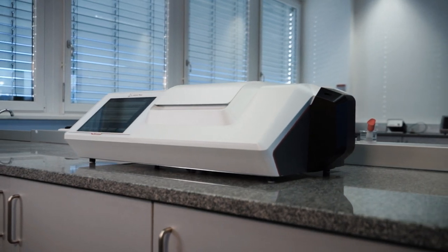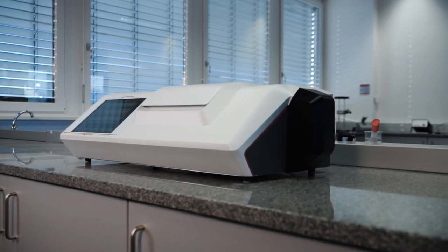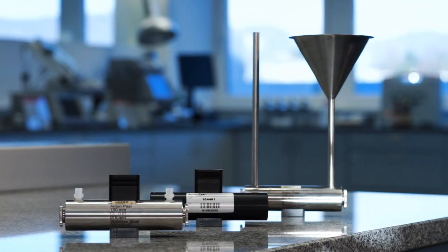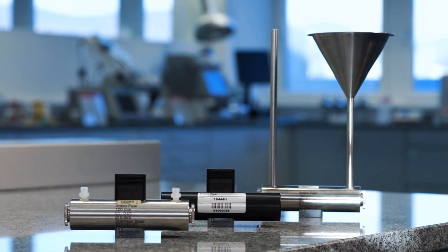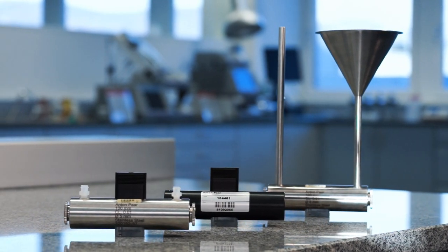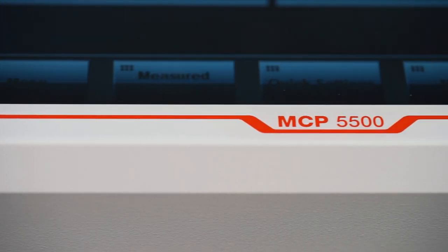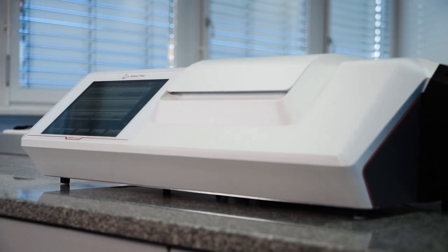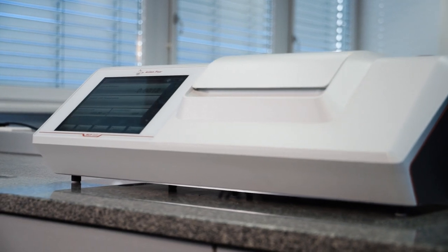The new MCP Polarimeter series, equipped with the long-life LED light source technology for all wavelengths, is virtually maintenance-free. Application-specific instrument configurations, such as multiple wavelengths, offer you the highest possible flexibility to meet diverse applications and adapt to your changing requirements in the future.